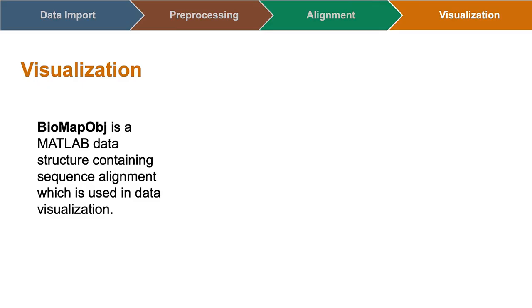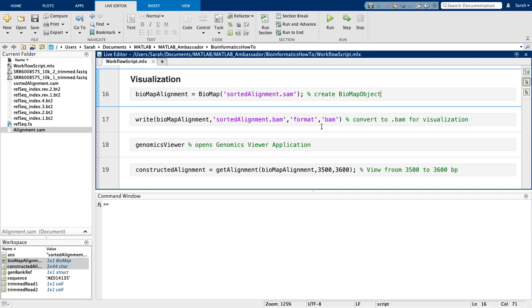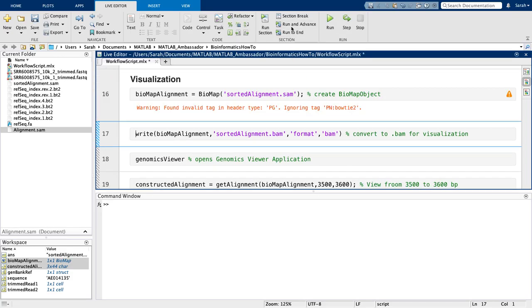To visualize this data, I will create a Biomap object. This object class in MATLAB contains data from my sequence read and alignment, including quality scores. It's a nice way to package all of this information in an interpretable way.